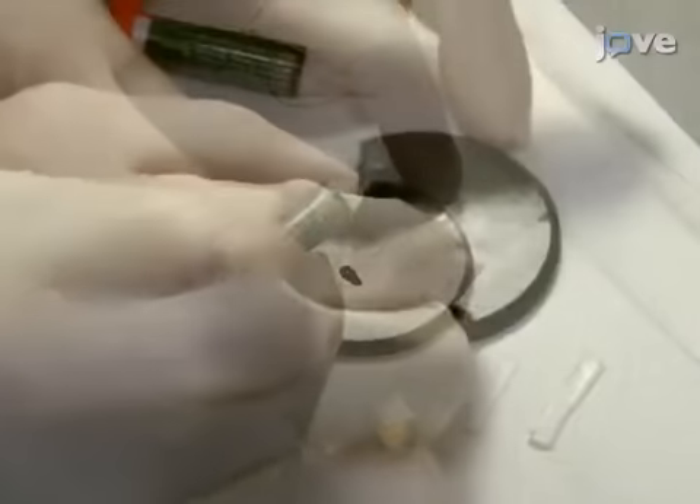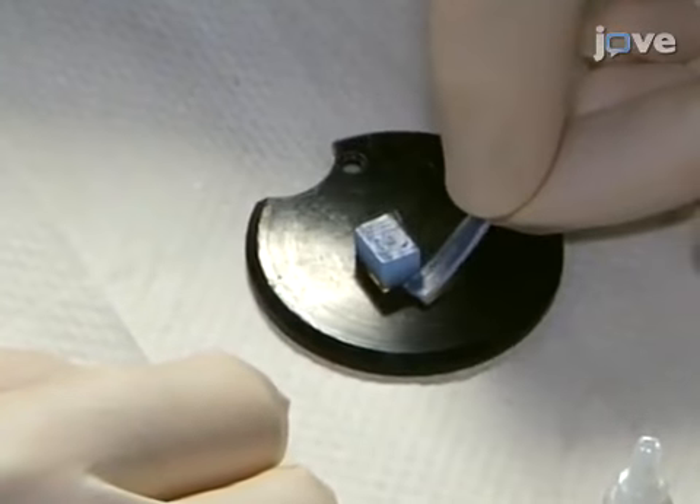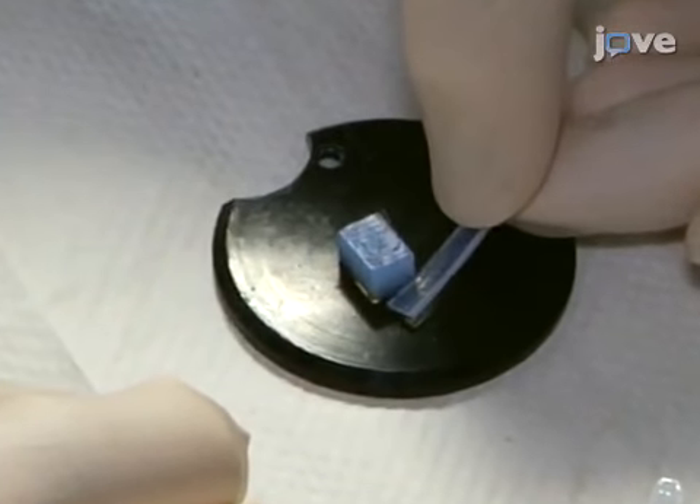Next, glue the backstop onto the stage with cyanoacrylate adhesive, and then glue the bump on the right side of the backstop such that they form an 80-degree angle.